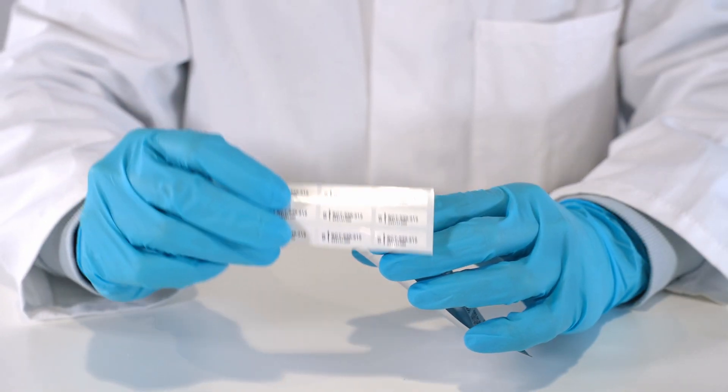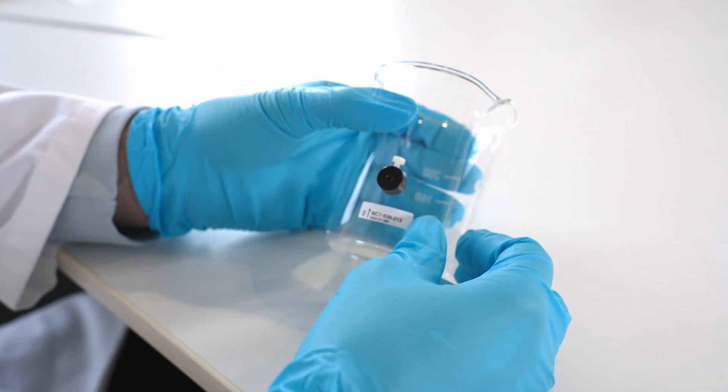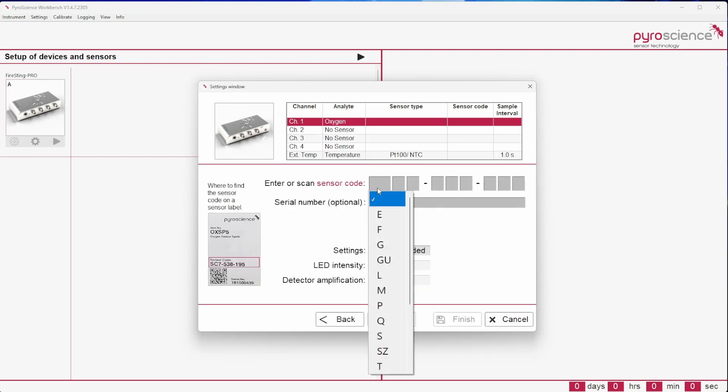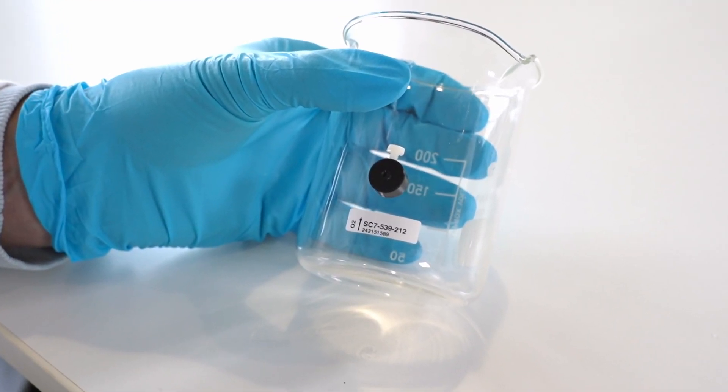Now glue one of the included stickers with the specific sensor code of the sensor spot at the outside of the sample container. This sensor code has to be entered into the respective channel of the software settings. The sticker also supports the subsequent assignment of the respective sensor.